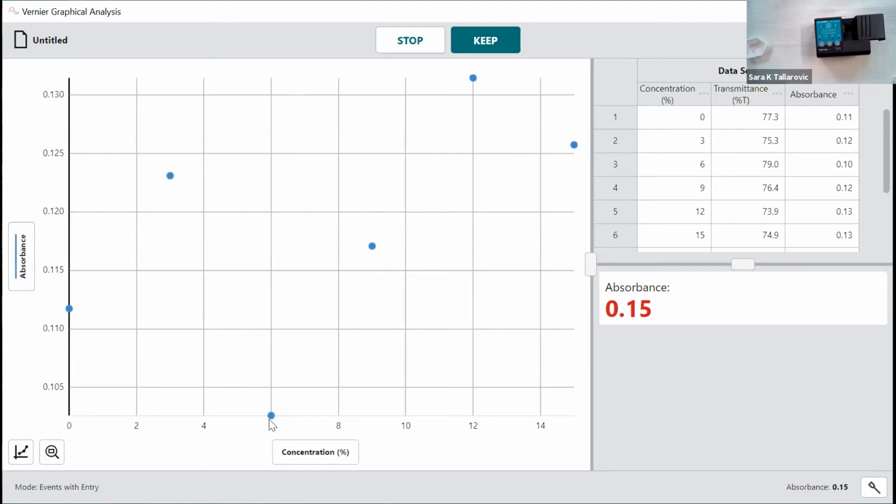But keep in mind that we started with our very, very low concentration. We've got probably what are hypotonic solutions with our cell. And then with the high end of values, we have what are probably hypertonic solutions, which means that in the middle, we're probably closer. Now, did we have somebody respond, Colleen? Yes, Mary says isotonic point.